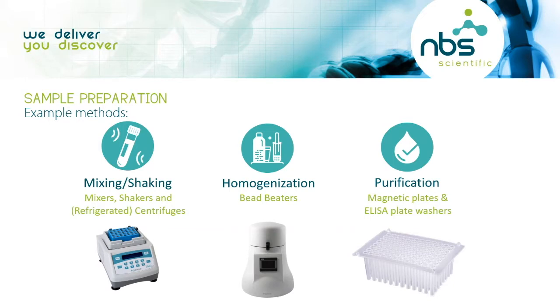After the preparation, you want to, of course, purify your sample. By doing this, you can, for example, use a magnetic plate washer or an ELISA plate washer. This is one of the systems you can use.